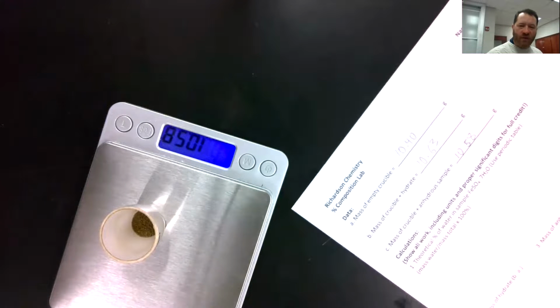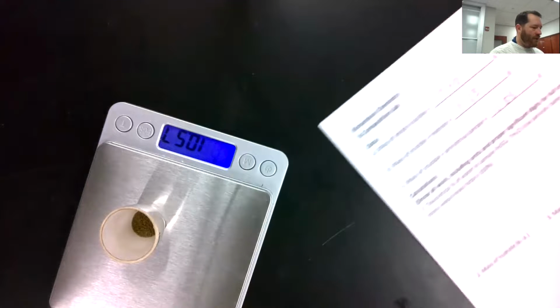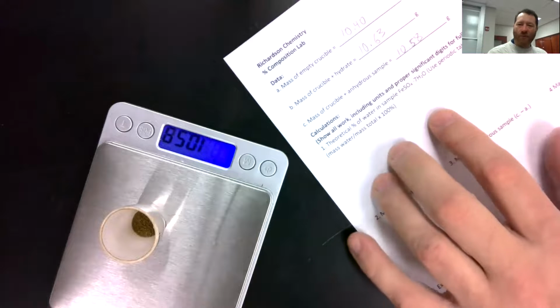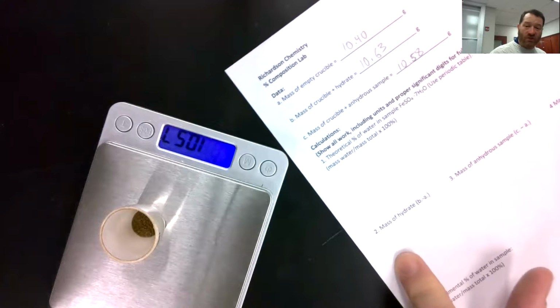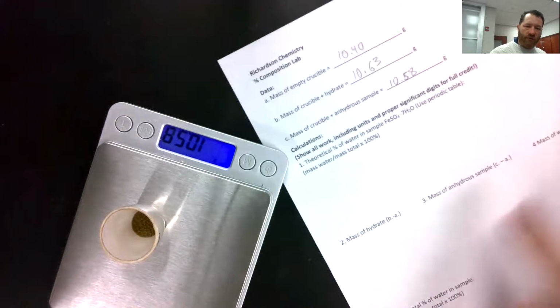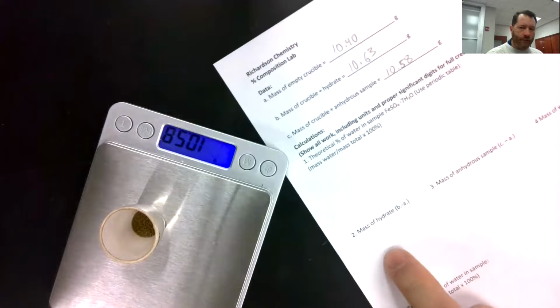You have all the data you need now to figure out this lab. Again, you probably had time to figure out the theoretical percentage of water. A couple of calculation steps: subtraction to figure out how much water was driven off and how much hydrate you started with. Make sure you are showing your work for these steps.